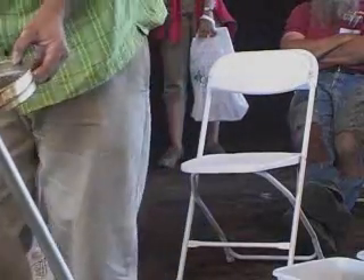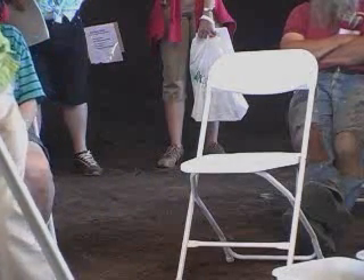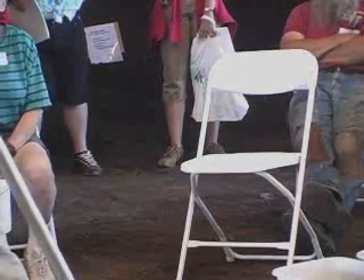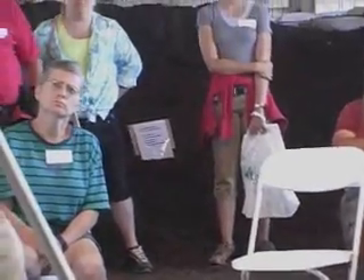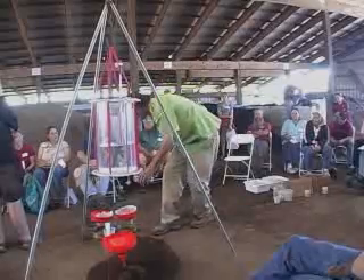This is a surface sample. If I wanted to go further with it, I'd go deeper in the soil and ask what happens further down when you use this cover crop. Those are research questions, or if somebody had a question and wanted to test that, this would be the way to do it.